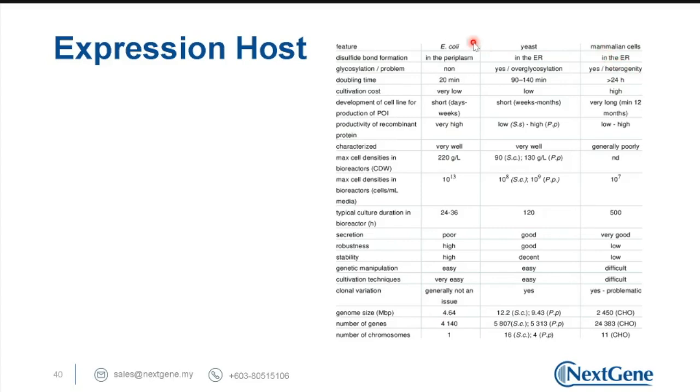However, you can always use E. coli to do a test run. You can also find some literature to see whether that particular protein will be able to fold properly inside the E. coli cell or not. Otherwise, some trial and error might be required.